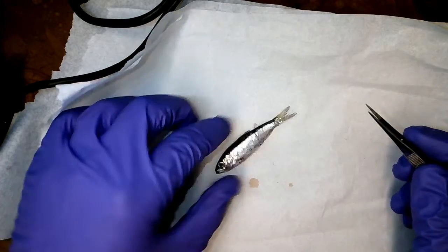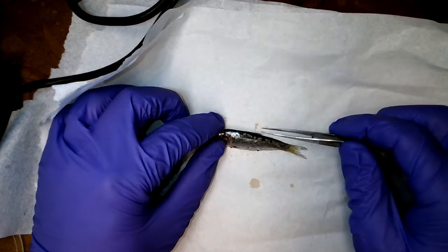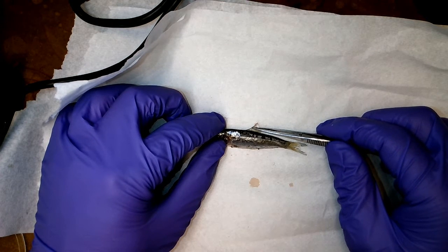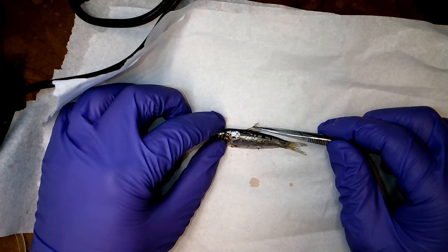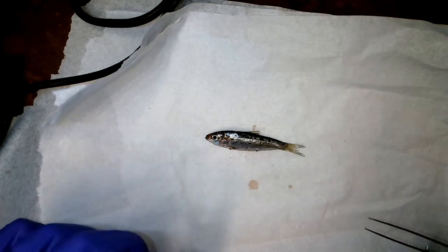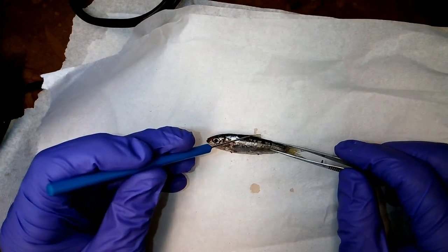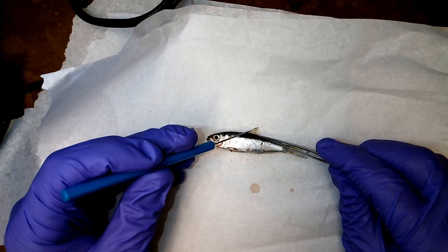This is really something that would be present on something called a threadfin shad. So if you spread the dorsal rays here, the last dorsal ray, so down here, let me get my other tool, spread this out. Okay, so it's not asking about the first, it's asking about this last one.